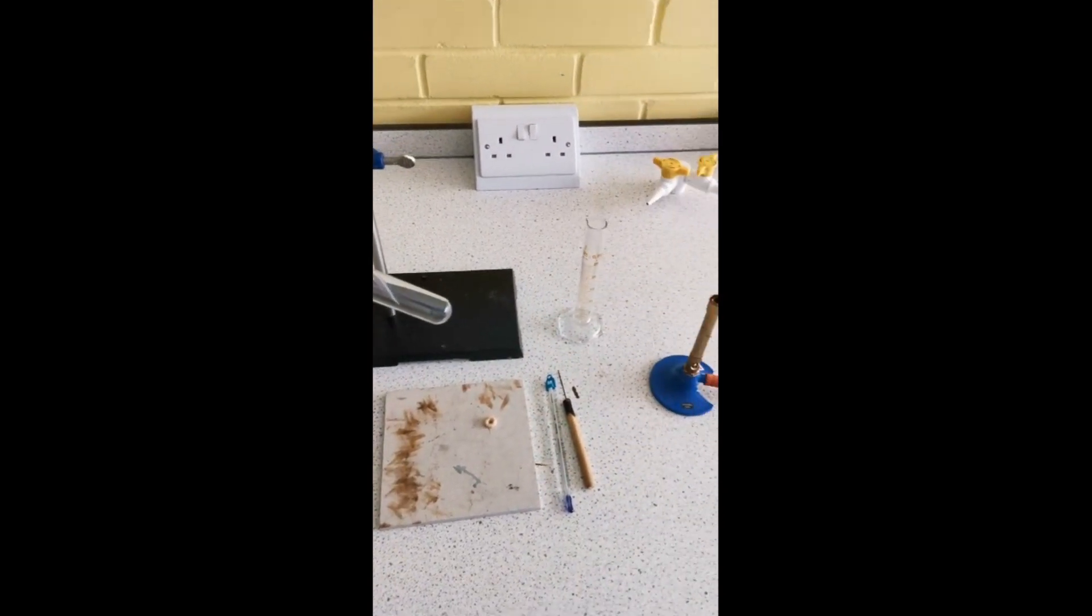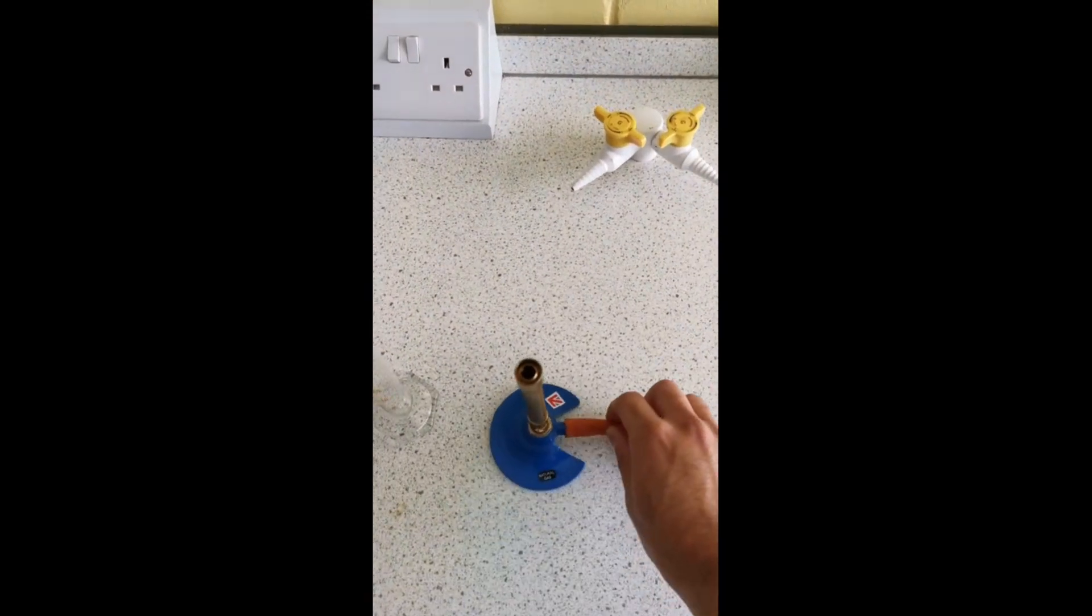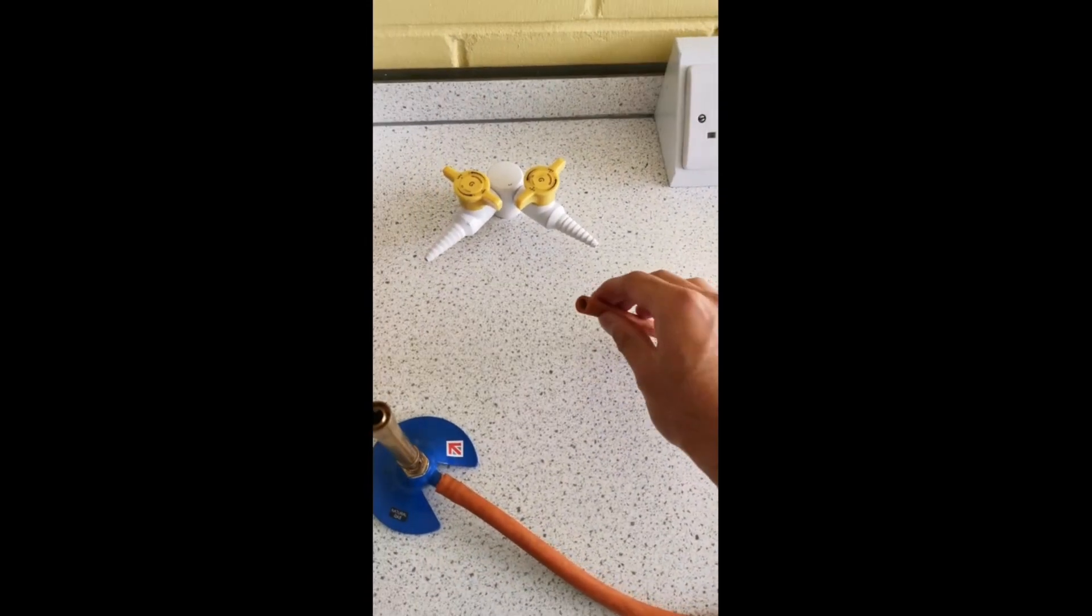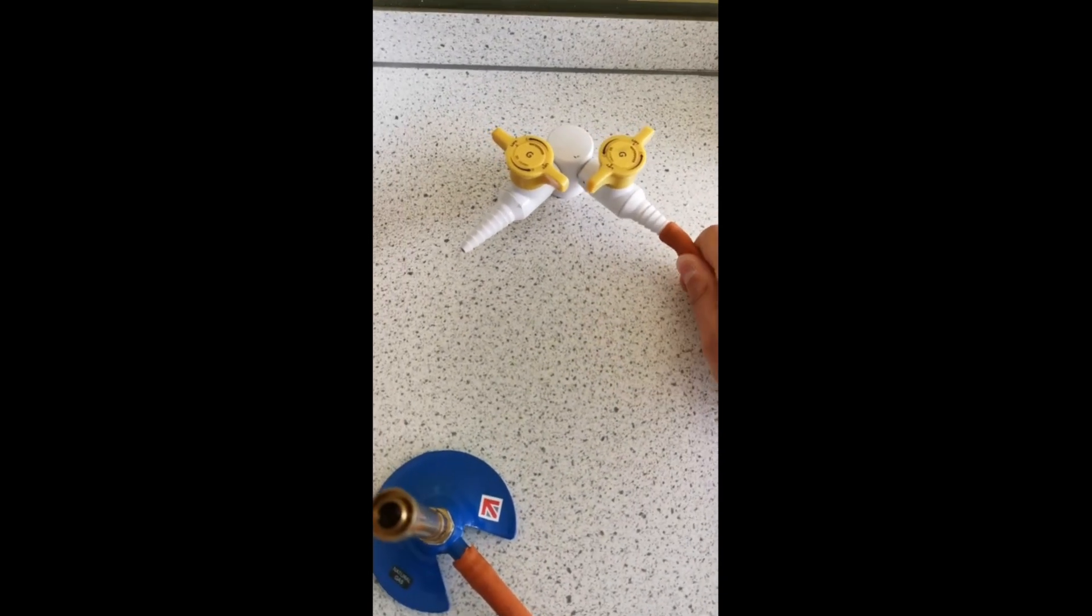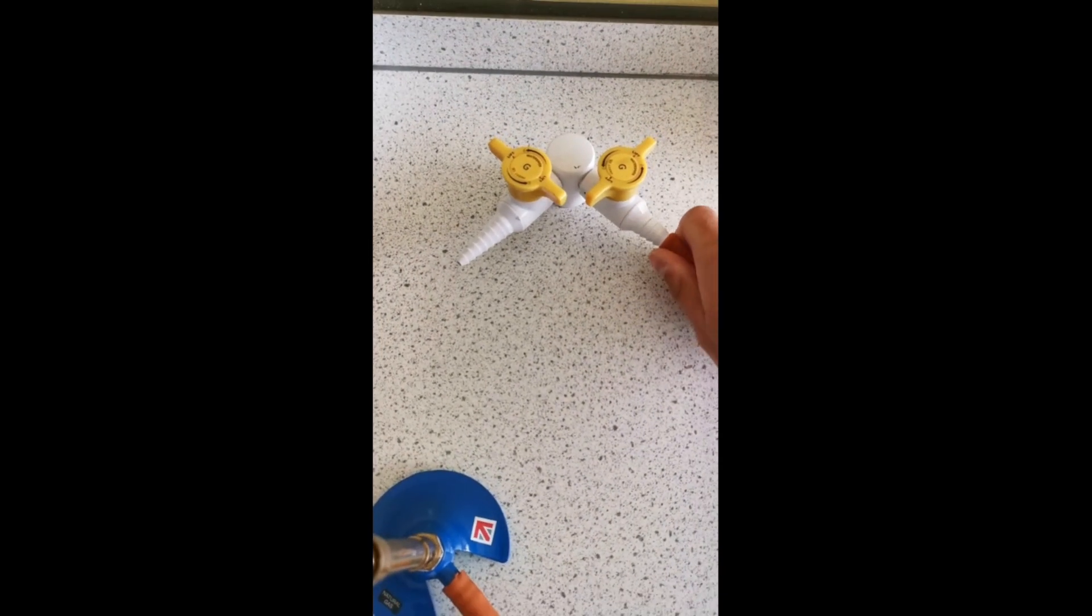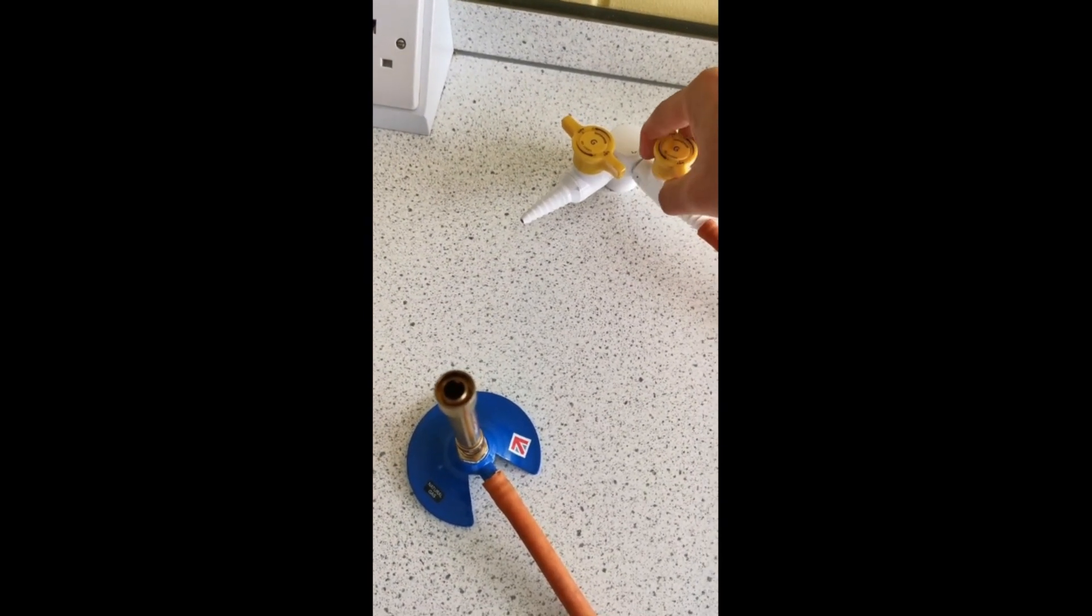All right, so this is the equipment you need to do the burning food practical. When you're setting up your Bunsen burner, it's very important that this hose goes onto the gas tap. Make sure you push it firmly on and that it's not loose. To turn on the gas, you lift this up and twist it.